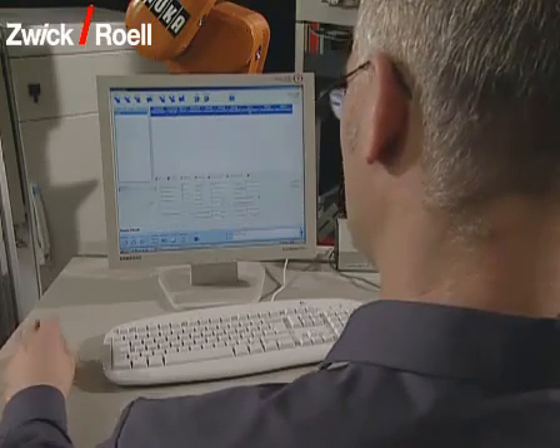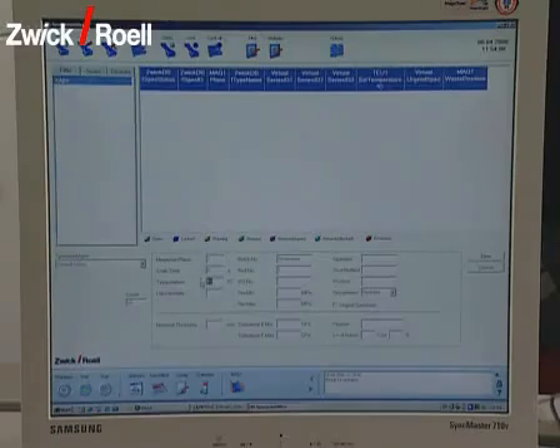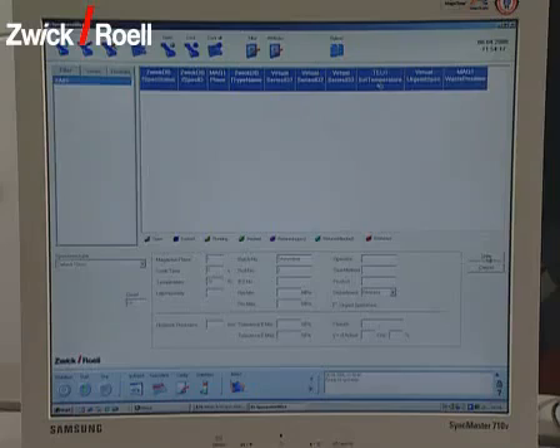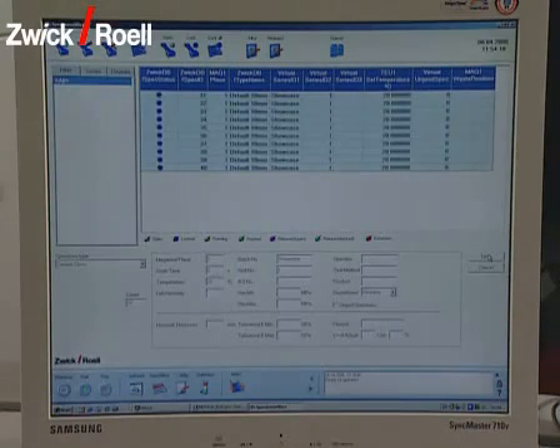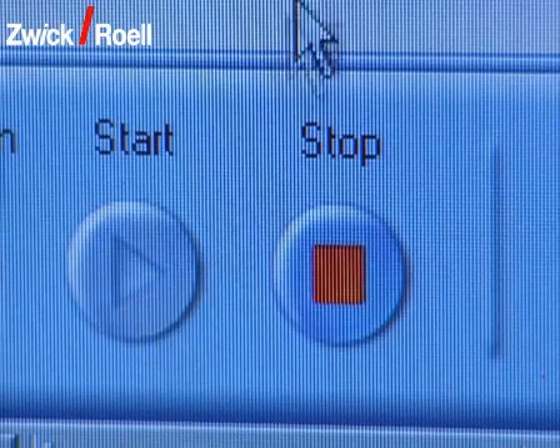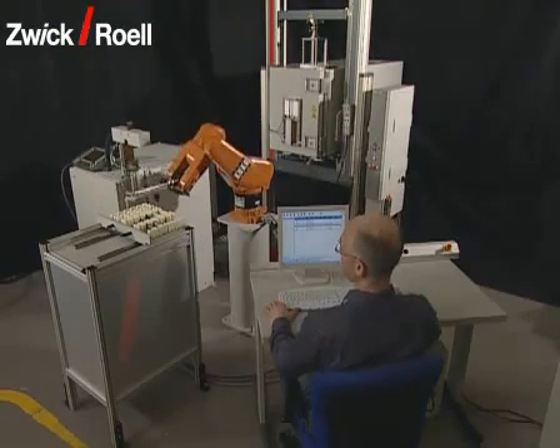Then, the data of the test series is entered into the computer by the operator. Alternatively, this data can also be transferred automatically from a higher order host computer. The starting of the unit is triggered with the button on the operator panel of the software.